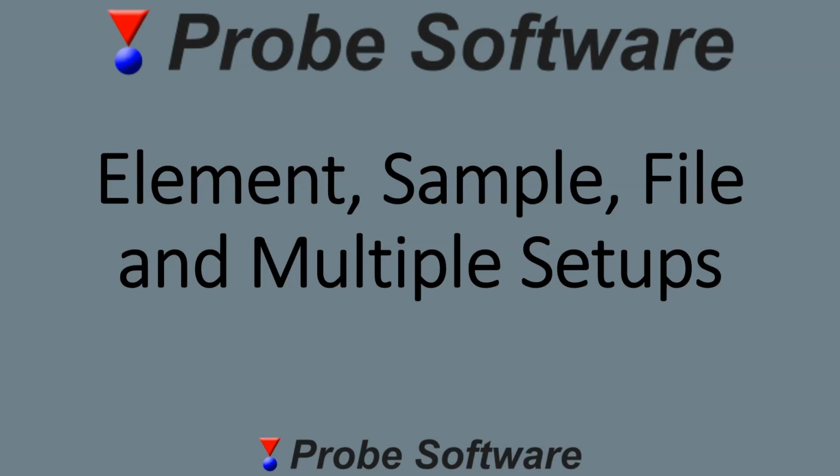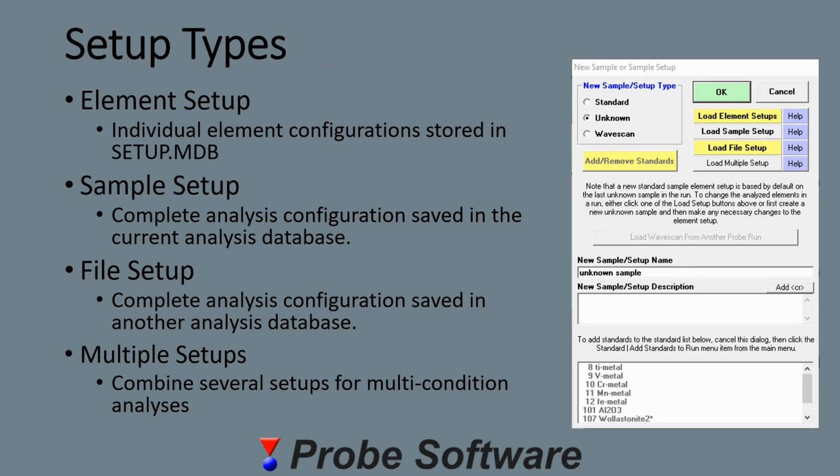One of the useful features of Probe for EPMA is the ability to save setups. In this quick video we're going to go through what the different types of setups are, why they're useful, and to give some examples. When you start a new sample setup, you'll see that there are several setup types.